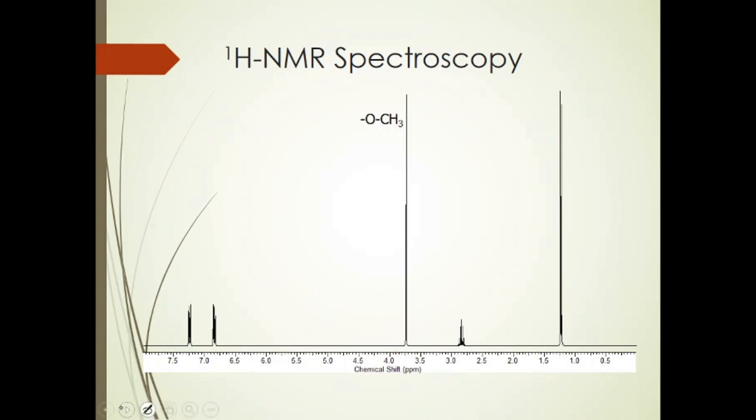Going to the next, or this first peak here, of course it helps to expand that, and we can see then this is a doublet. 2 peaks, meaning then that it is bonded to 1. So remember, this was 2 CH3s. And the splitting tells us that they are bonded to a methine, a carbon that has 1 hydrogen. So we have this pattern. And so this is the methyl groups of an isopropyl group.